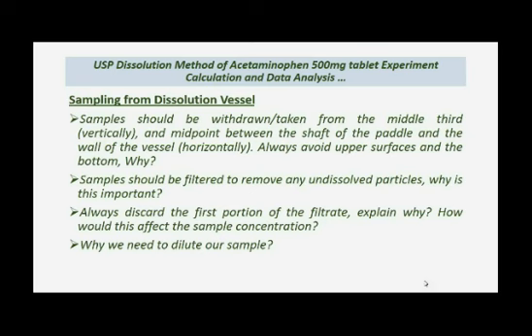This will affect the absorbance measurement. Always discard the first part or portion of the filtrate. This was explained during the practical session video. Why we need to dilute our sample? To avoid absorbances higher than the absorbance range.